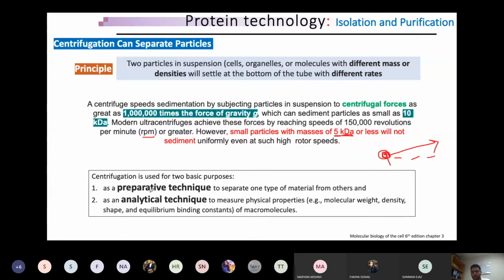So it's not now one cell, it could be millions of cells or 10 millions of cells, greater cell material, so that you could get more amounts of protein. Because you are working with 10,000 proteins, and out of 10,000 proteins, it's very hard to separate one molecule. So you have to increase the number. So that is why you might not be working with 10,000, you might be working with 1 million cells. Because in 1 million cells, there are much better chances that you might have 100 molecules present. You might have 1,000 molecules present.